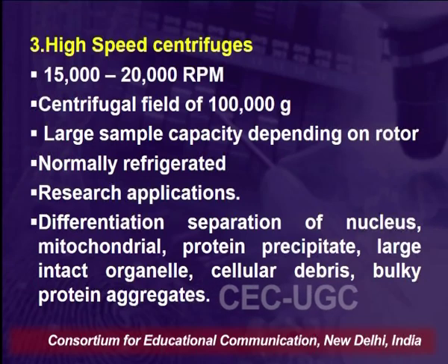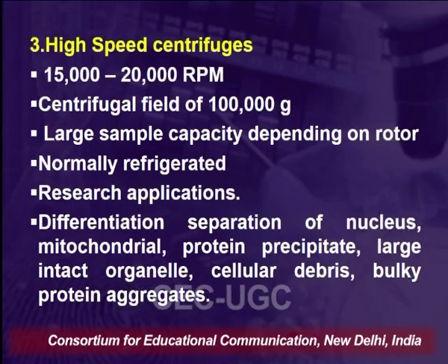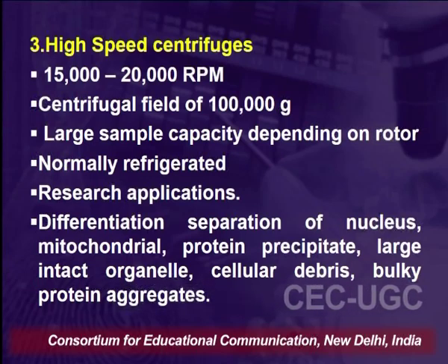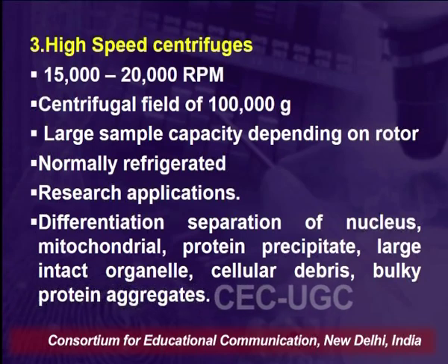Normally the high speed centrifuges are refrigerated and they have research applications like differentiation, separation of nucleus, mitochondria, protein precipitation, large intact organelles extraction, cellular debris, bulky protein aggregates. So, basically whenever we are doing molecular biology work, we require the high speed centrifuges.